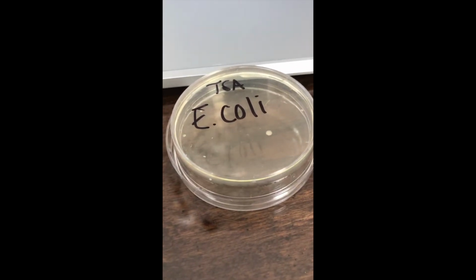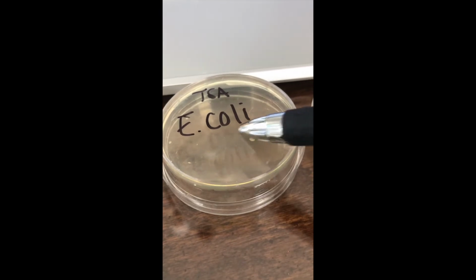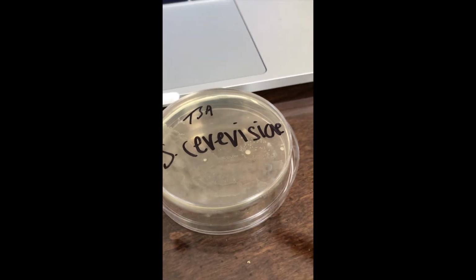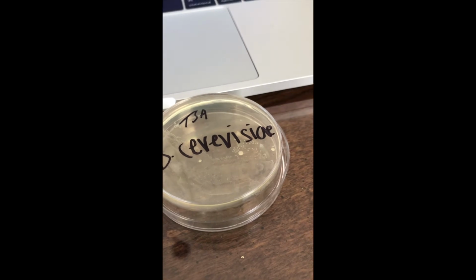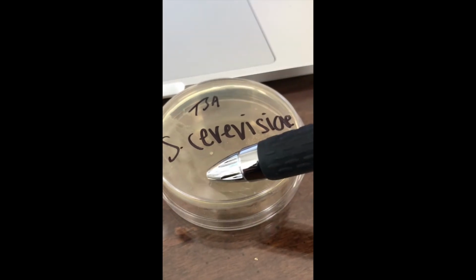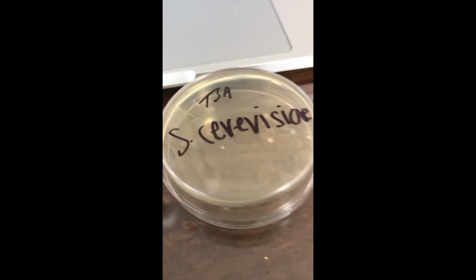The Escherichia coli had a little pinpoint, and the Saccharomyces cerevisiae had a mix of both, with some punctiform and undulate, and also filamentous shape.